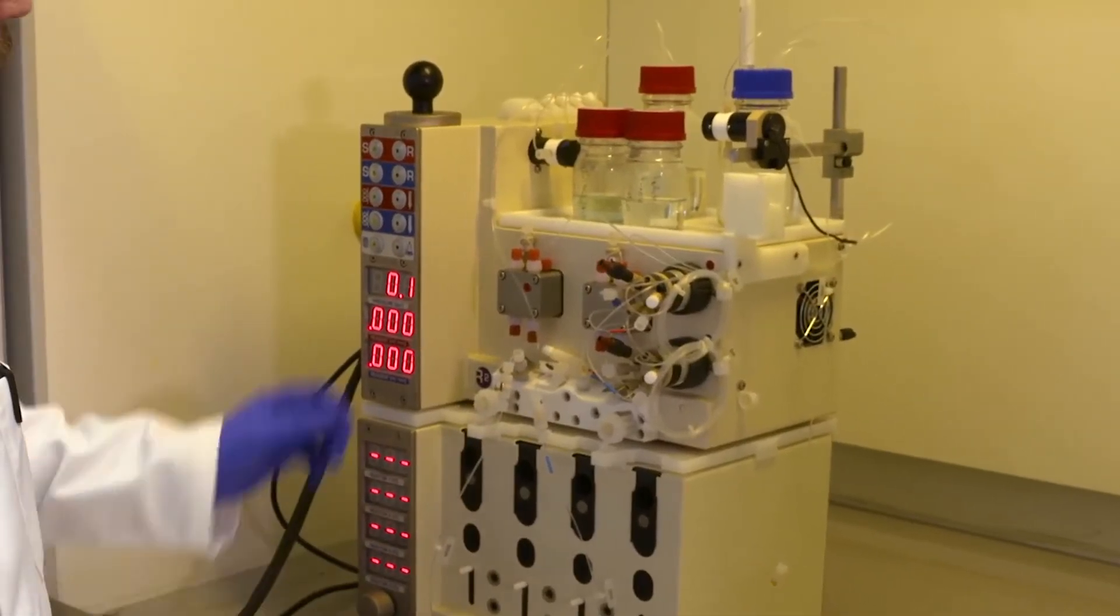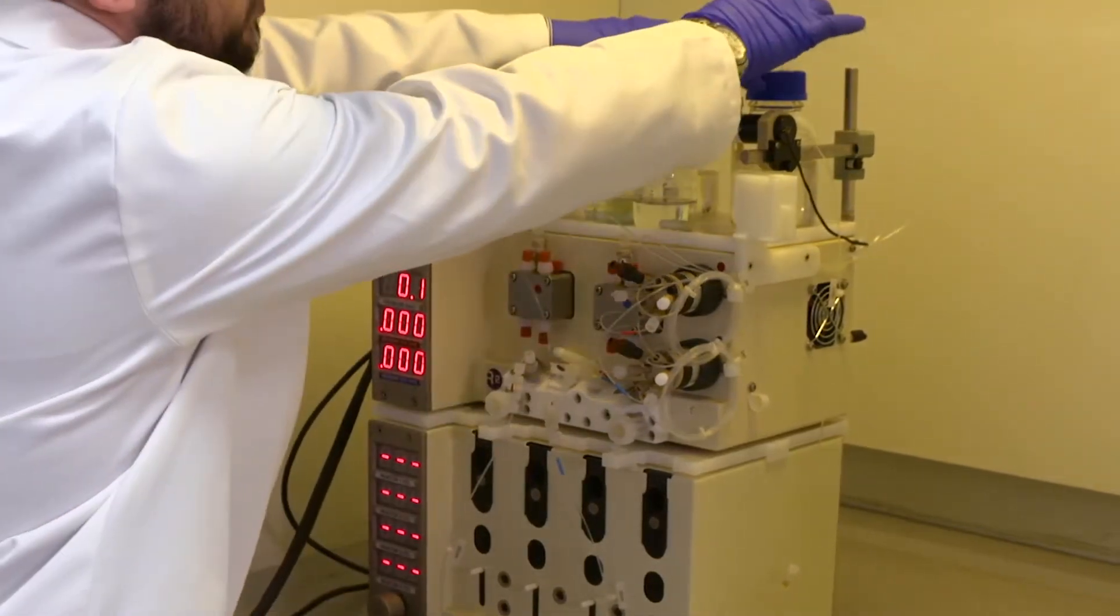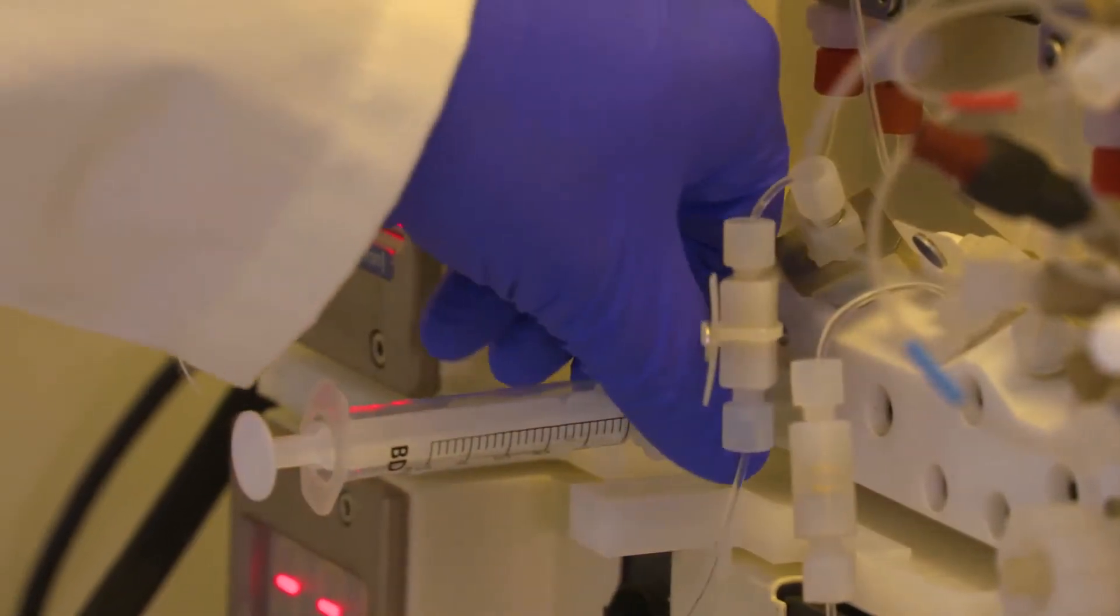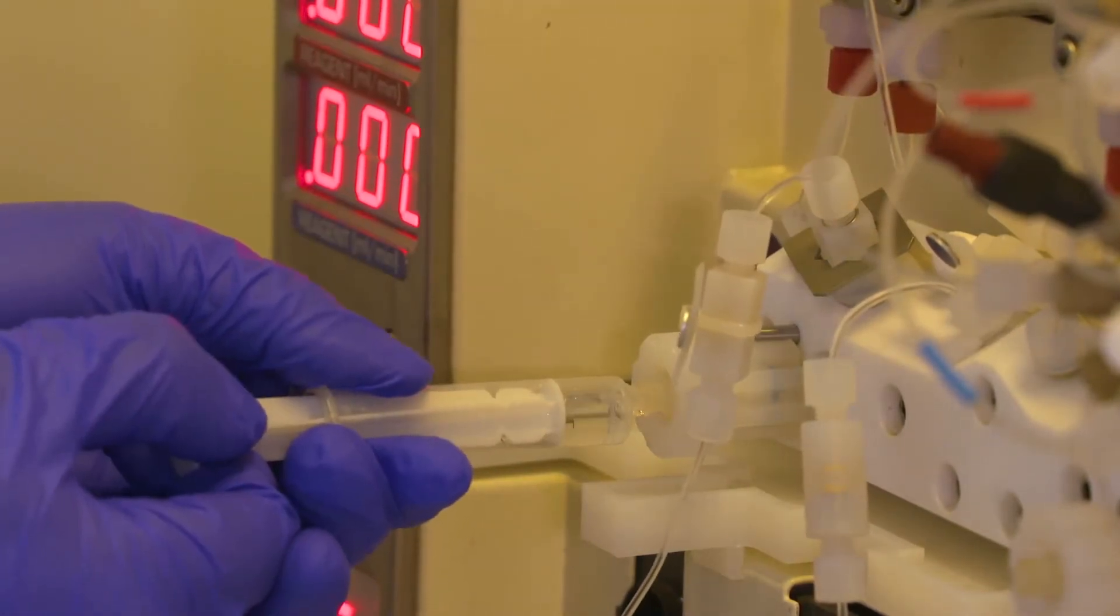To fill the pump with solvent, the first thing to do is put the switching valve into the reagent position. Then using my syringe, I open the priming valve one full turn and pull through one or two milliliters of solvent.